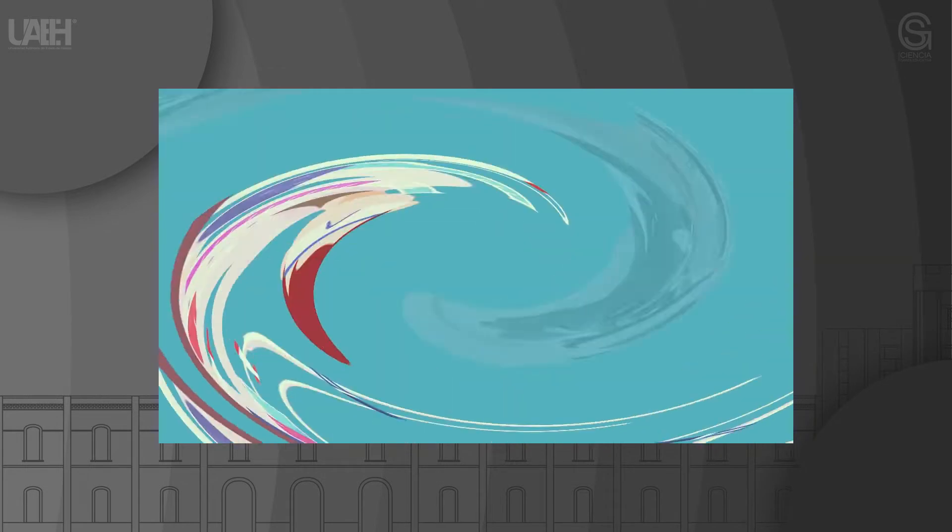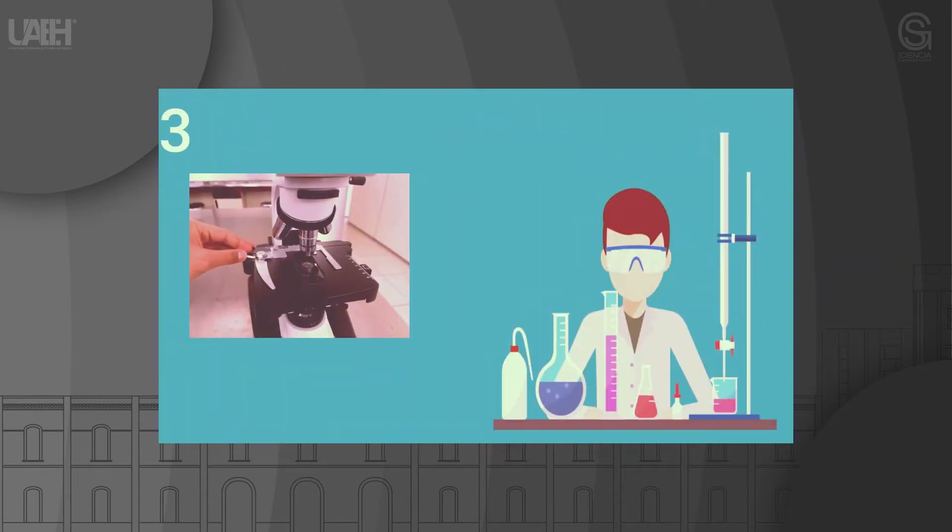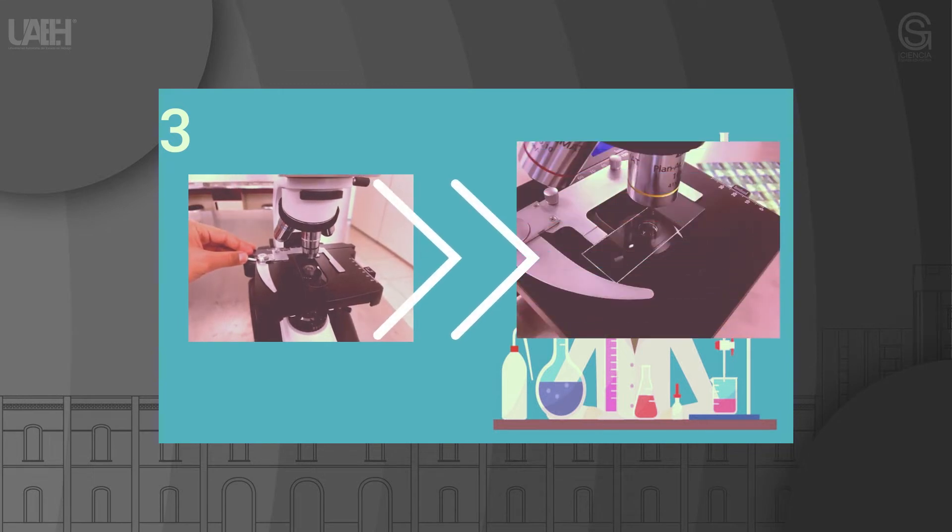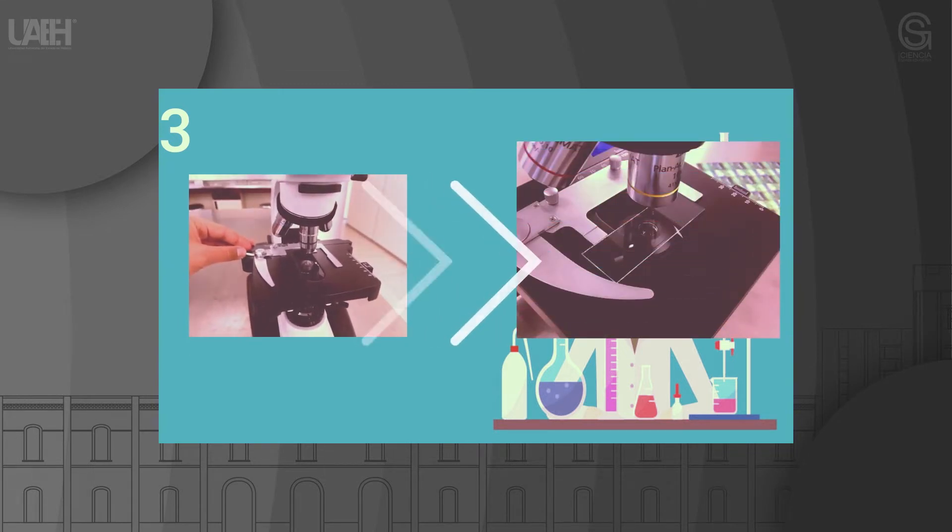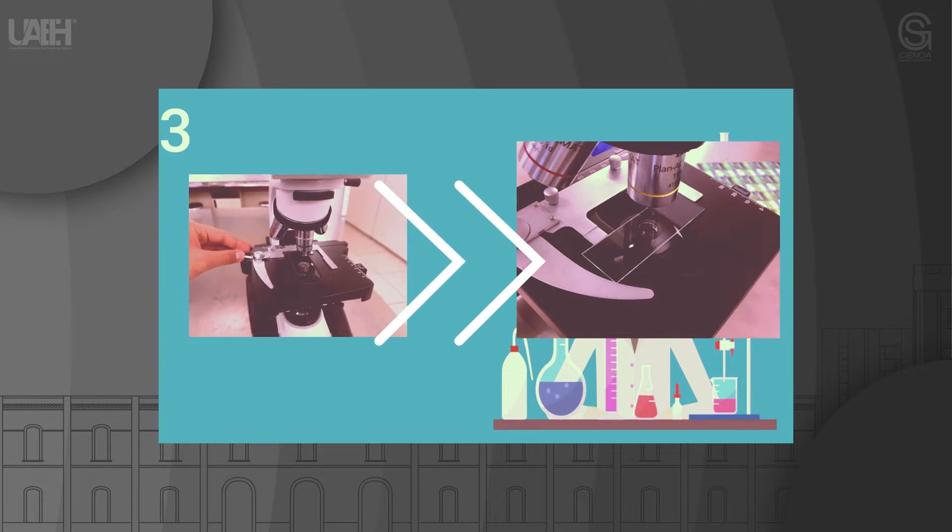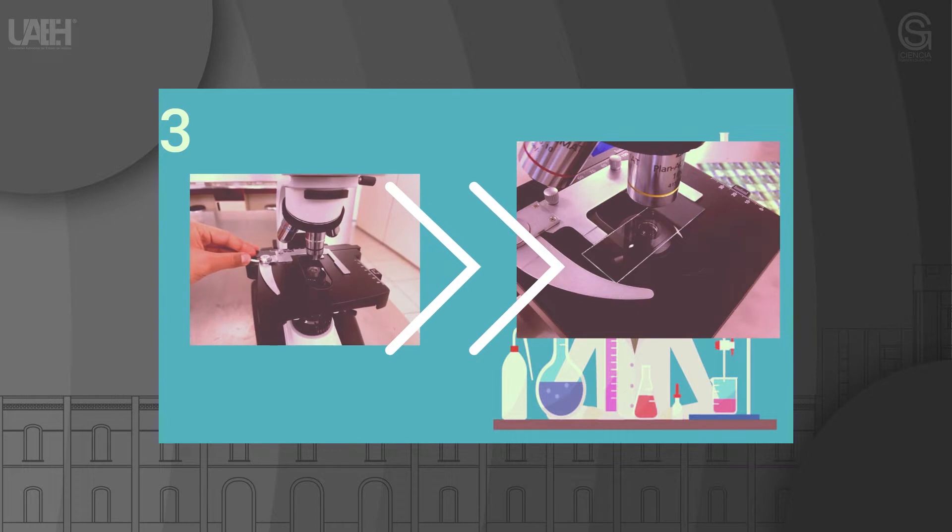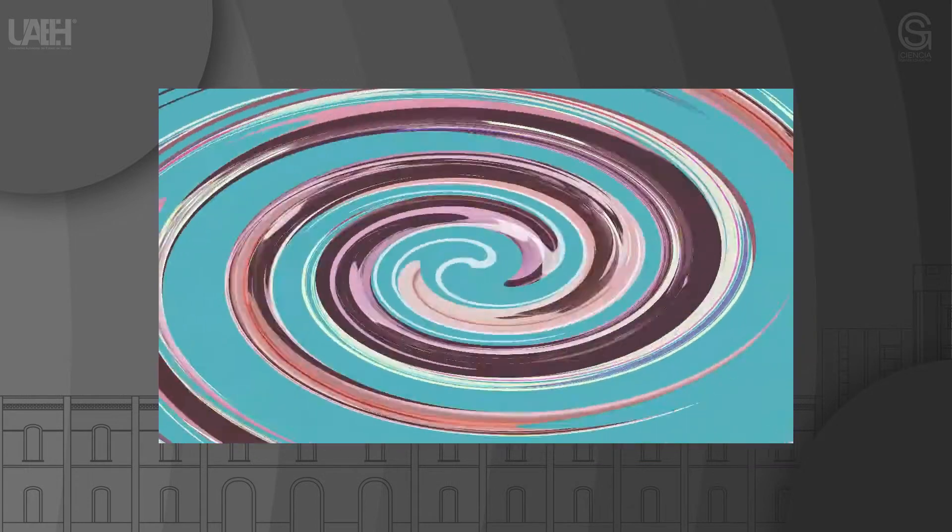Step 3: Place the slide with the sample in the center of the stage. Make sure the sample is approximately over the hole in the stage. A well-prepared sample will be covered with a cover slip to prevent contact between the objective and the sample. You can properly fix the sample using the clamps on the stage.